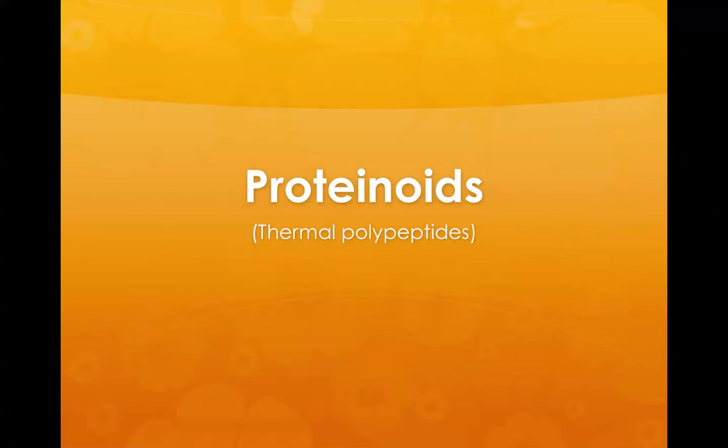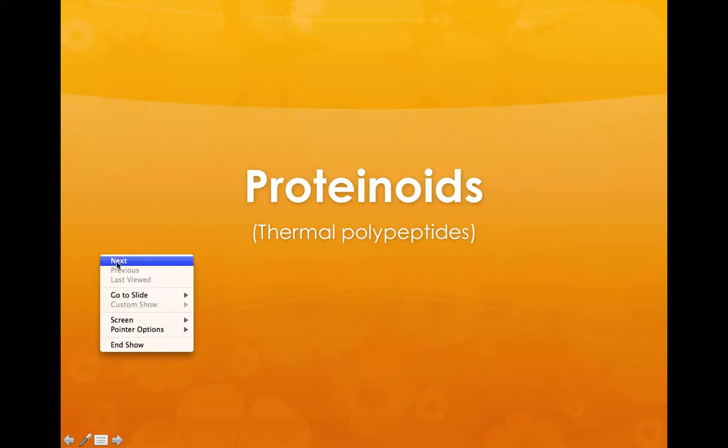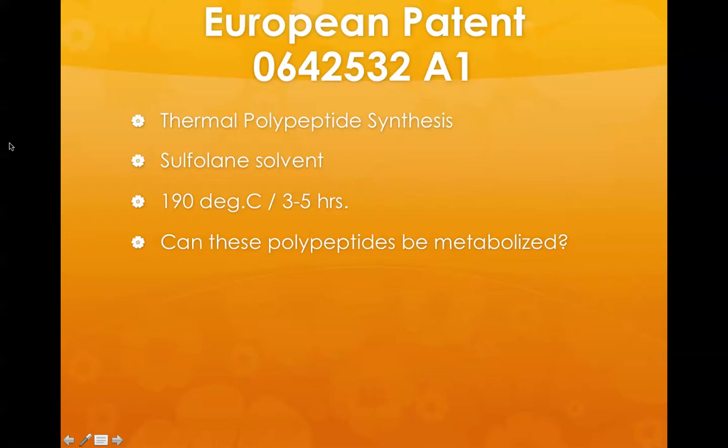Now, with these materials, in the case of the amino acids, with the exception of achiral glycine, I'm starting with the L enantiomers. Organic chemists would call the L configuration S. During the course of heating these to 190 degrees Celsius, a degree of racemization of the chiral carbons is expected to occur. So these materials will have incorporated the amino acid residues, but at the same time they will have a percentage of D incorporated. Will they be metabolized by selected microbes?